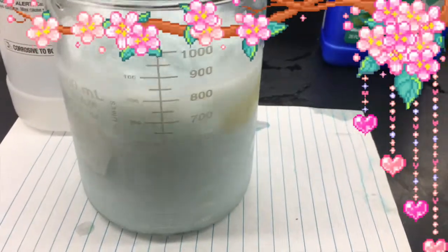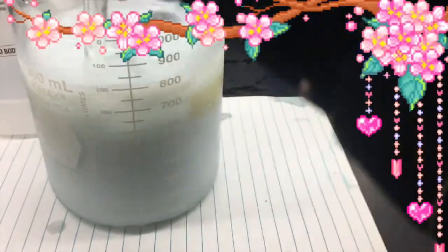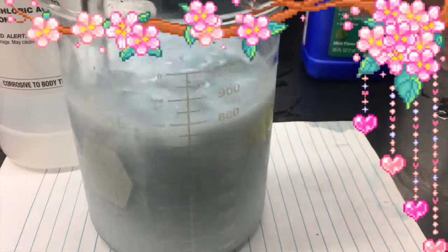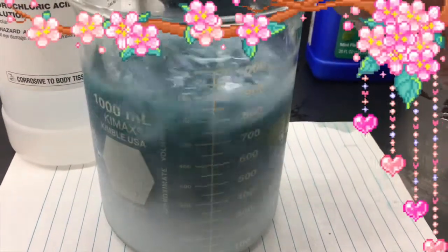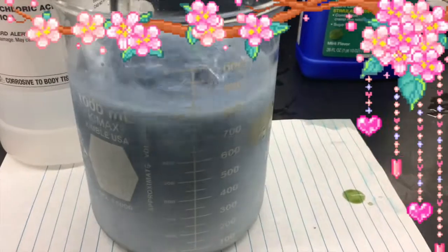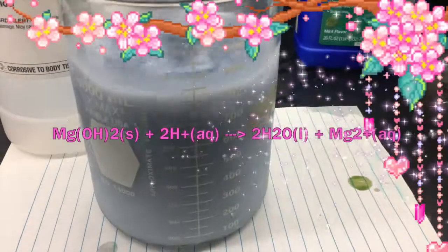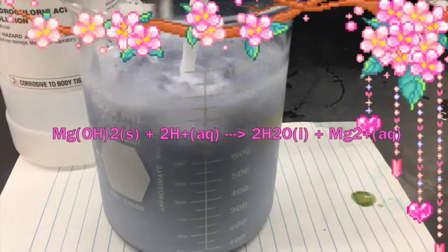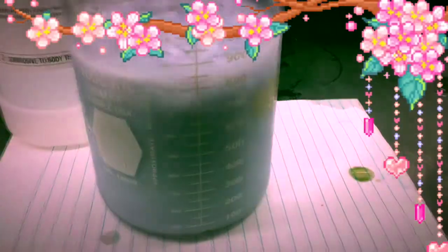During the process, the color of the mixture goes through the entire universal indicator color range, from red to orange to yellow to green to blue, and finally back to violet. By adding more stomach acid, the process can be repeated several times before all the Mg(OH)2 is dissolved and eventually neutralized.